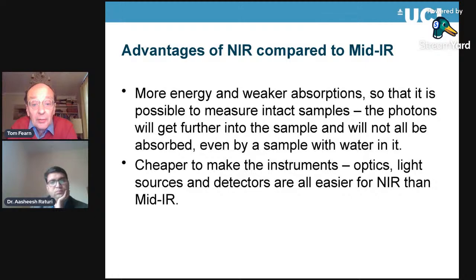That doesn't mean you can't use mid-IR instruments. Some NIR instruments are actually Fourier transform mid-IR instruments that have had their range extended down to work in the NIR, but you can also build relatively cheap instruments as well. That's another reason, although less important than the fact that you can measure intact samples and you can measure wet samples with NIR.